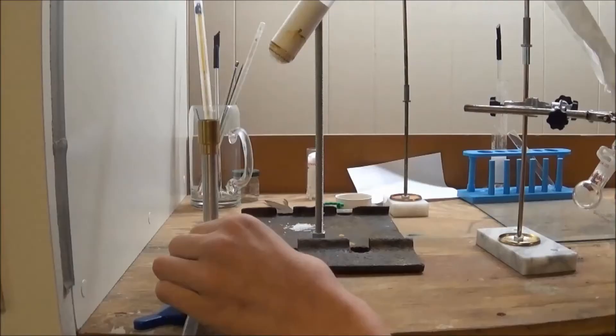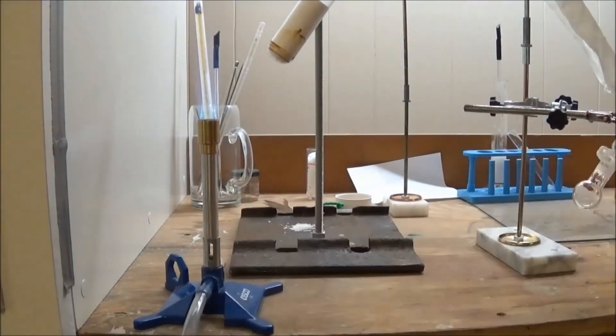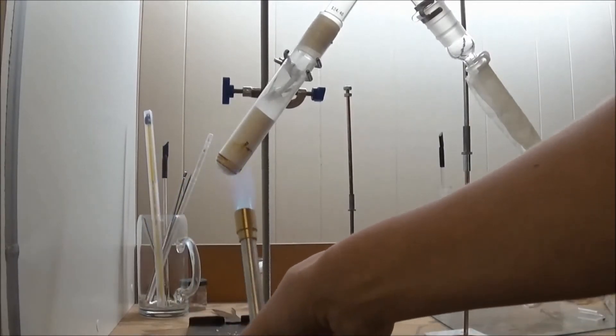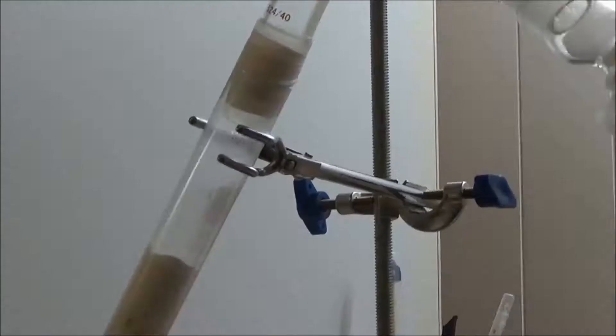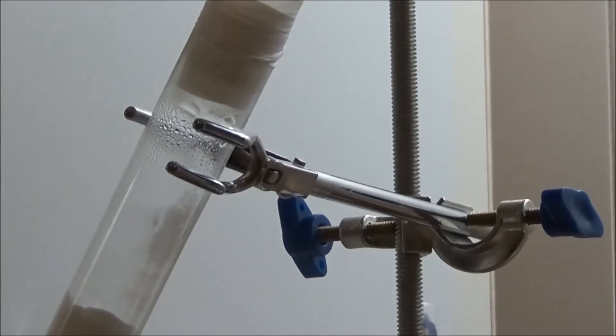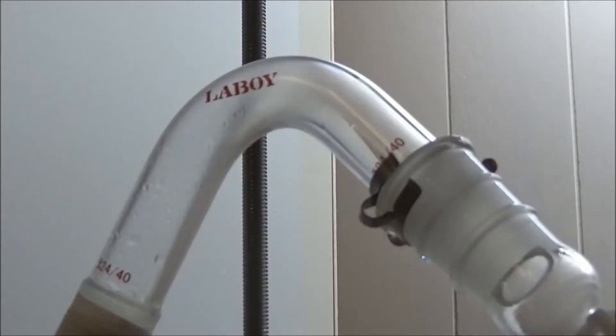When I was ready I lit my Bunsen burner and began to gently heat the test tube. After a minute or so I began to see condensation on the glass. With further heating, vapors managed to reach the condenser.